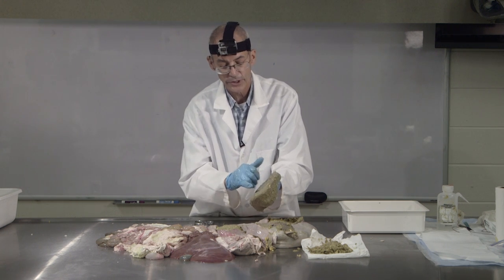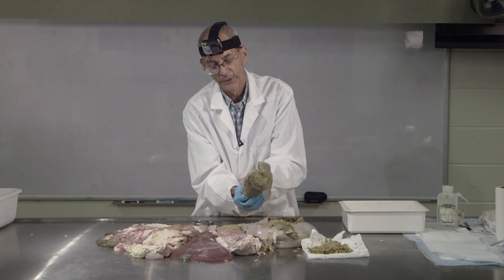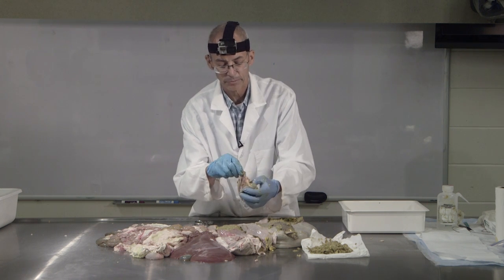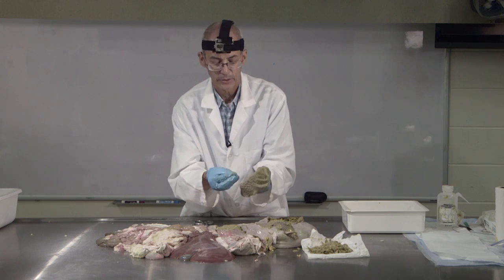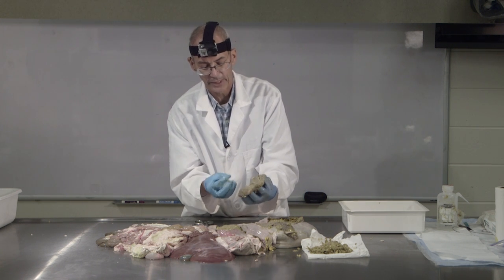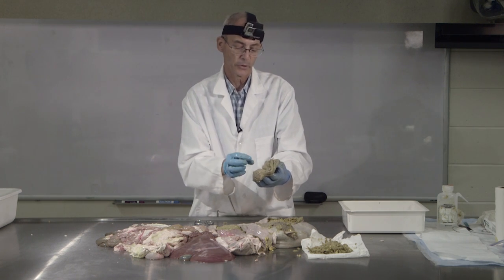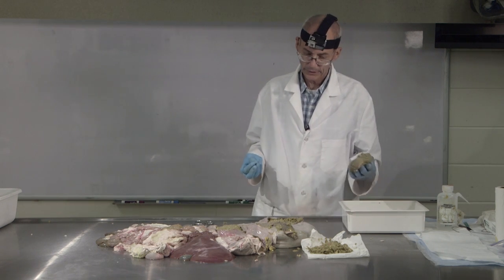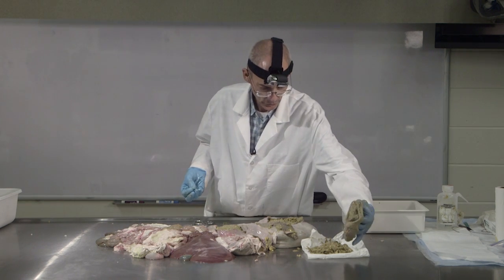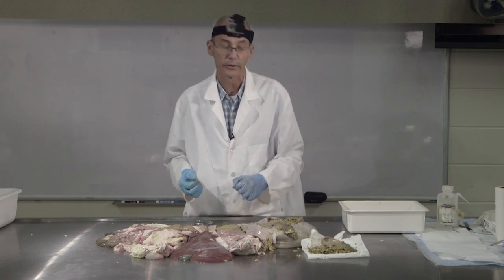And it's these ridges that trap larger pieces of food material. If you can envision this thing kind of folded back around on itself, those cells are not quite as spread out. They'll be a lot smaller, and they can catch any kinds of stems or long leaf material in that and bounce it back into the rumen so that it can be worked on further as far as digestion goes.